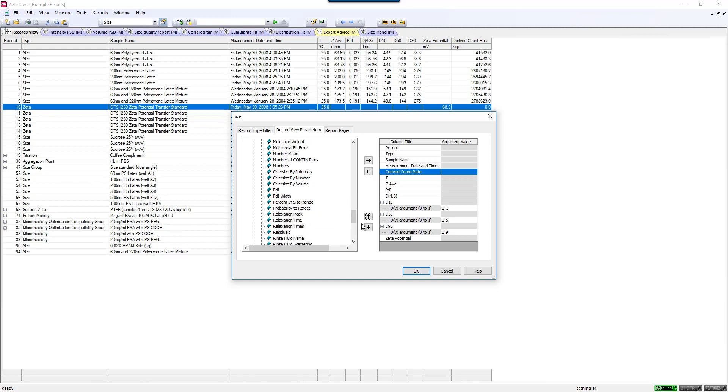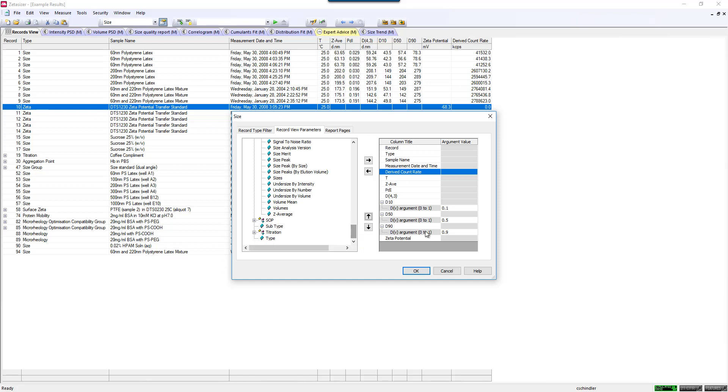You can do all sorts of different parameters in here, your PDI, of course, your PDI width, and you can make this fully customized to whatever you would like to see.